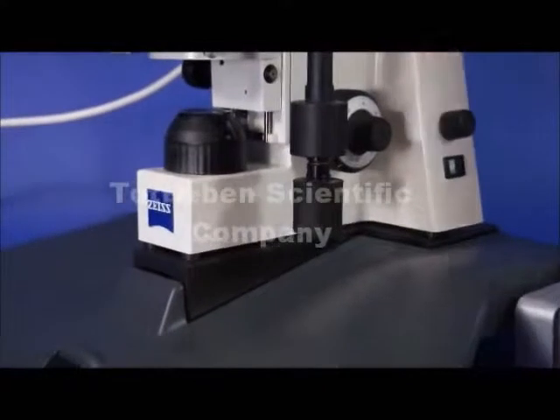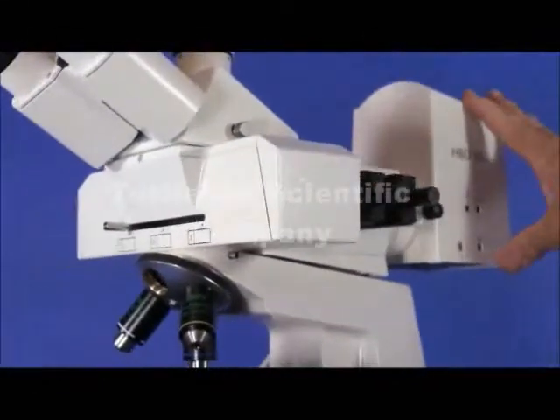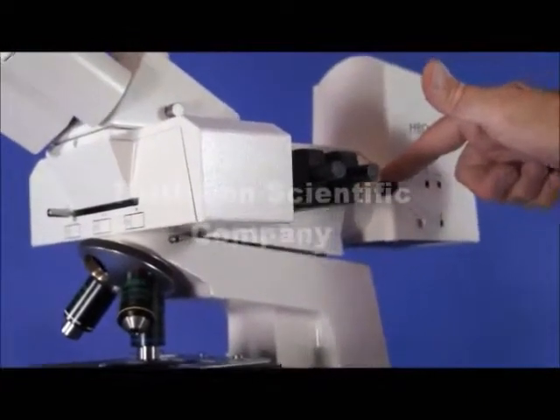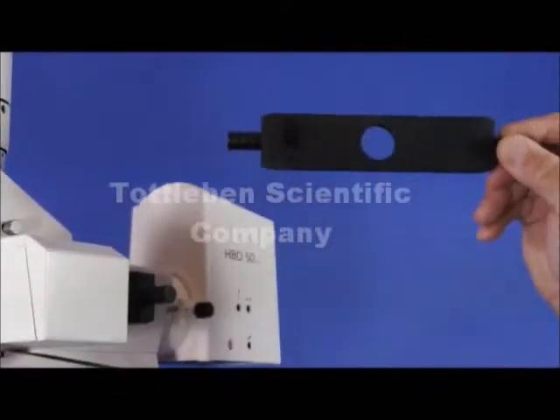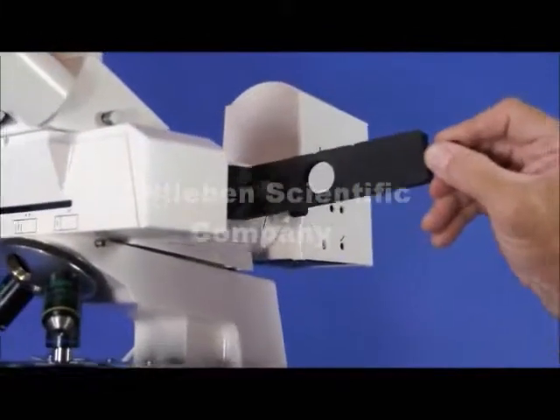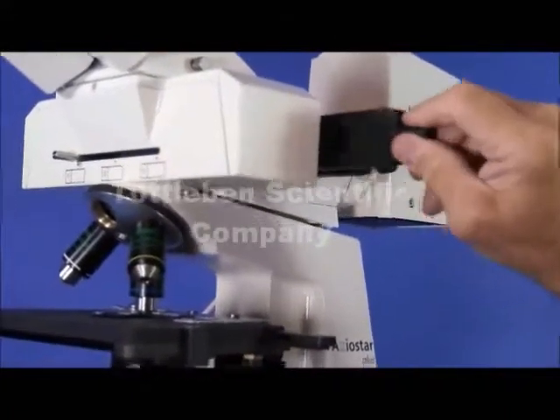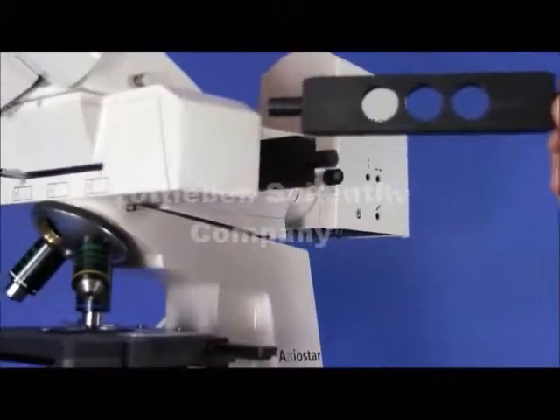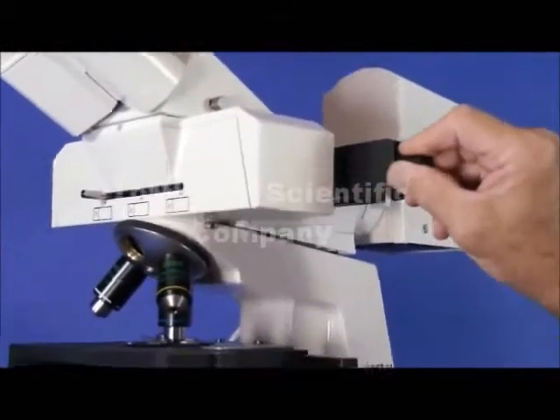On the side of the vertical illuminator for fluorescence you will see first of all the 50 watt lamp housing and the focusing knob for the lamp housing. You'll see a field stop which blocks or lets the light through for epifluorescence, and also an additional slider with three openings so that you can add filters of your choice depending on the kind of stain and excitation wavelengths you're using.